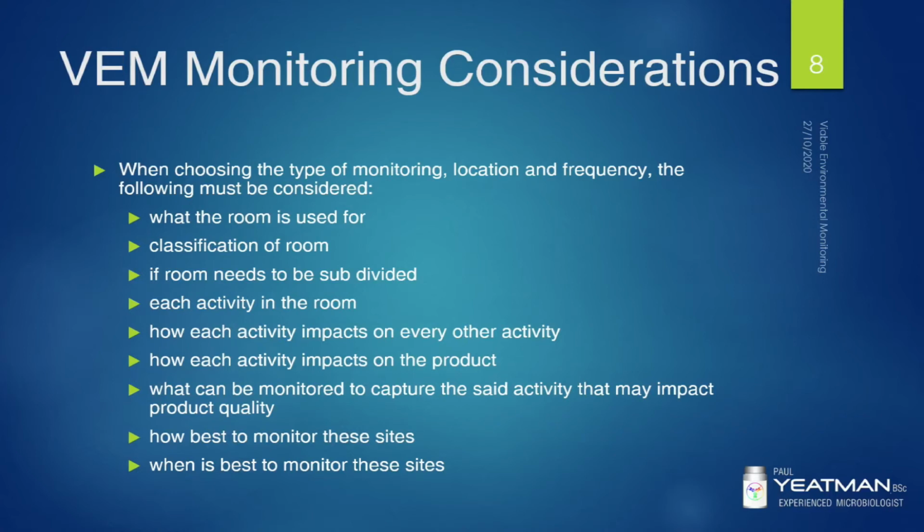So one thing you would have to consider here is your monitoring is a snapshot in time, and if you can't determine when that contamination was introduced, unless you can determine that by video of the batch or questioning the operators, then you have to assume worst case, which would be it was there from the start. But as part of this investigation, you'd need to investigate such things as microbe recovered, autoclave records, sterility testing results, bioburden results, and they all help you sort of target the likelihood that the microbe was there for the entire batch.